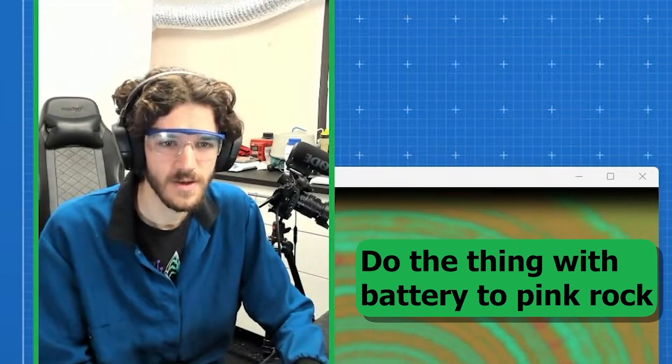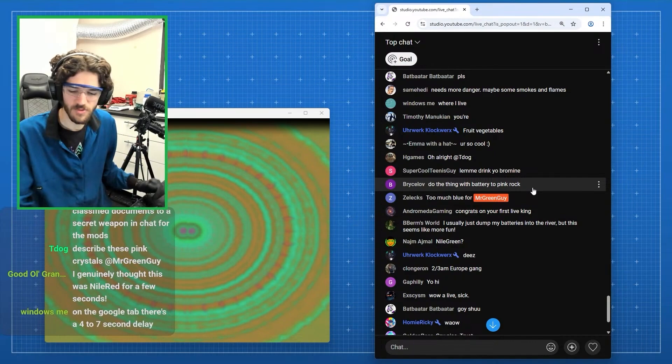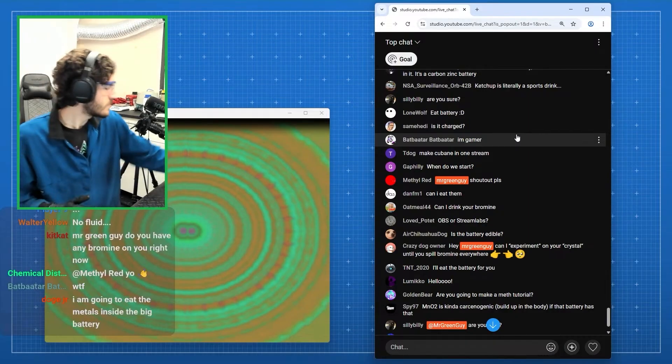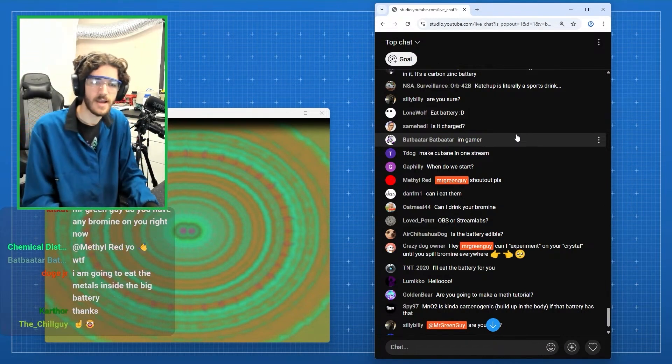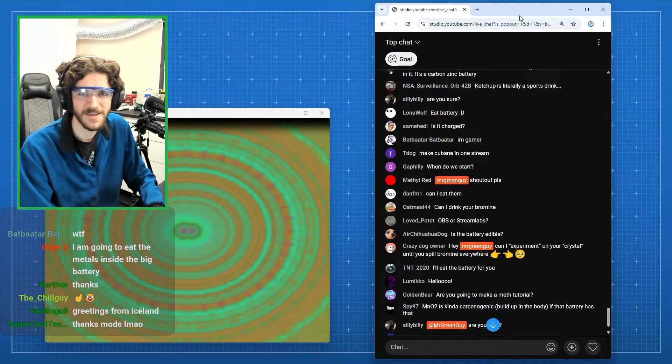Welcome! Do the thing with battery to pink rock. Yes, I will be doing the battery to pink rock. Here it is. Here's my battery. So there's a few different ways to do it. I'll probably show you the different methods out there, but hopefully we'll end up with some nice pink crystals. That's the hope anyway.